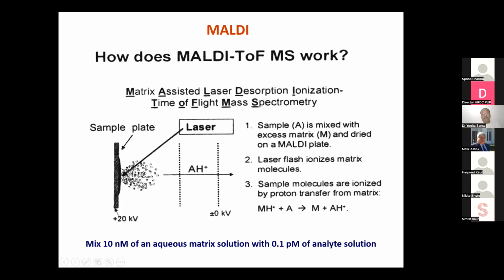This plate is maintained at high potential, and then a laser beam is incident on the plate where the sample is deposited, and the laser induces heat.